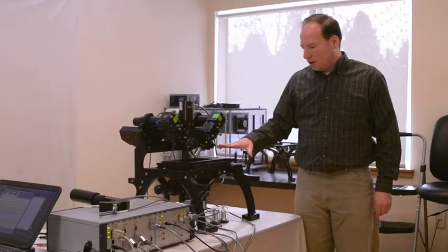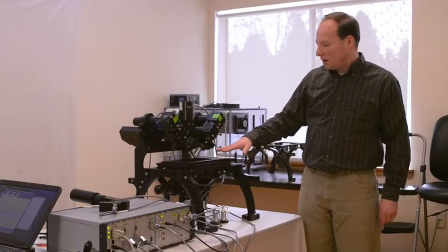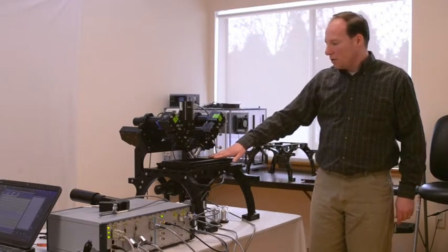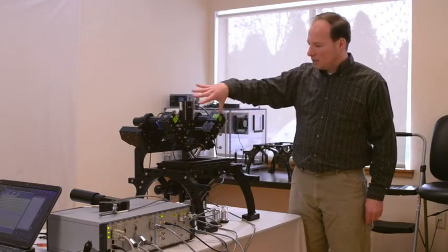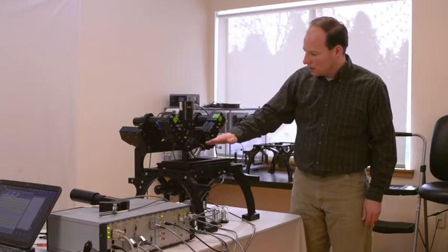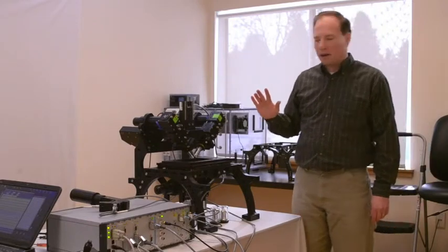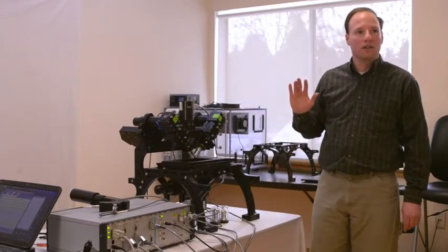The inverted microscope is simply used for finding the region of interest in the sample. And we can mount the DI SPIM part of the system, which is everything up here, on any other inverted microscope, including those made by other manufacturers.